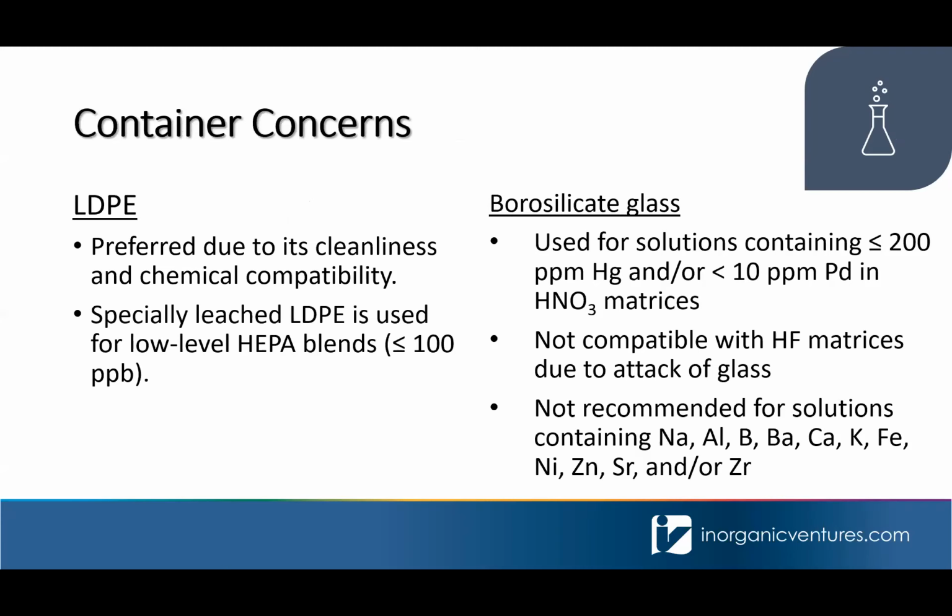The composition, cleanliness, and matrix compatibility of the preparation and storage containers that you're using are also important considerations for maximizing CRM stability. LDPE, or low density polyethylene, is the most commonly used container type at Inorganic Ventures. This is because it's the cleanest and it provides a broad range of solution compatibility. So we can put a variety of different solutions into an LDPE container. Also, we can utilize a specialized leaching process to ensure an even cleaner bottle for low-level solutions. We call these HEPA blends.